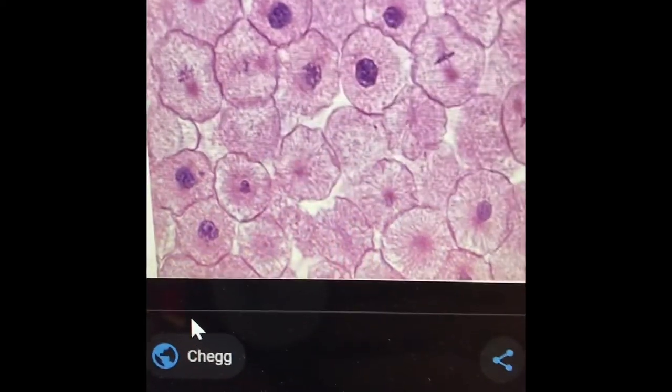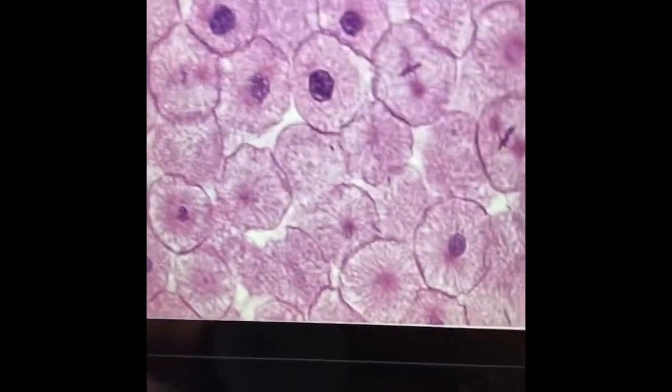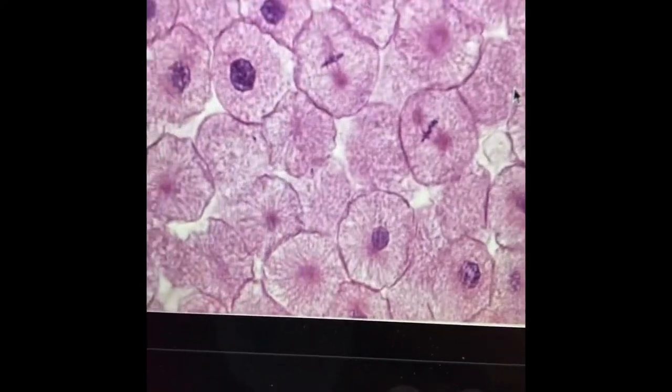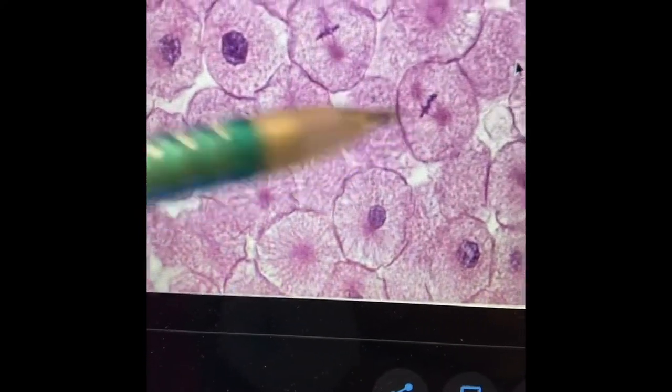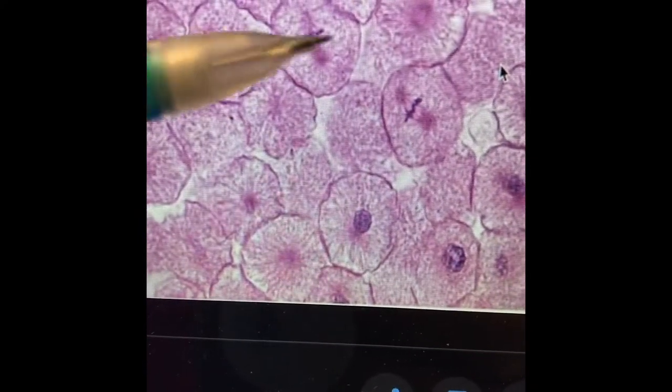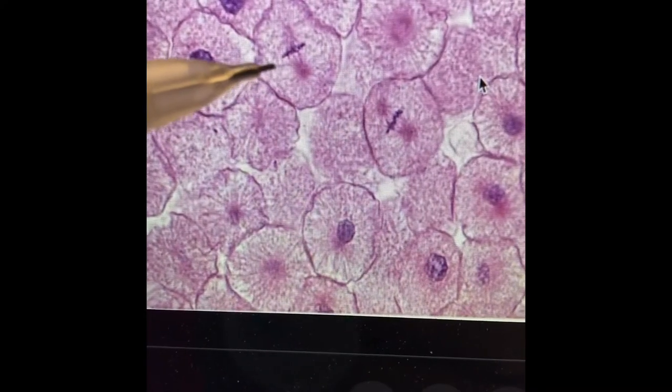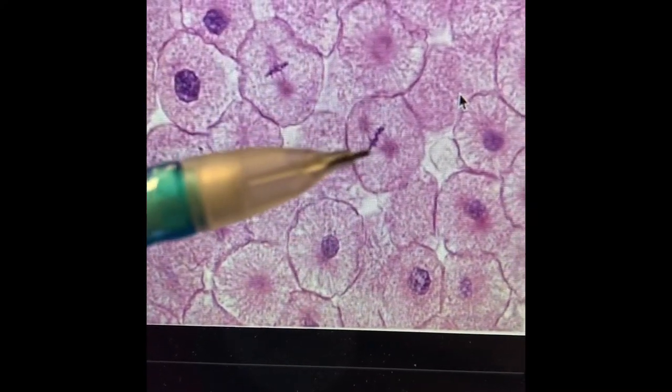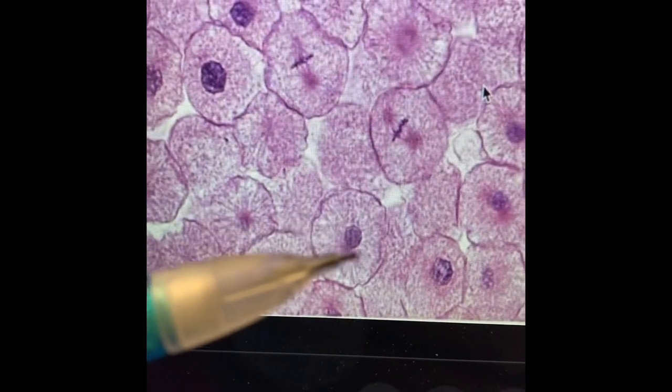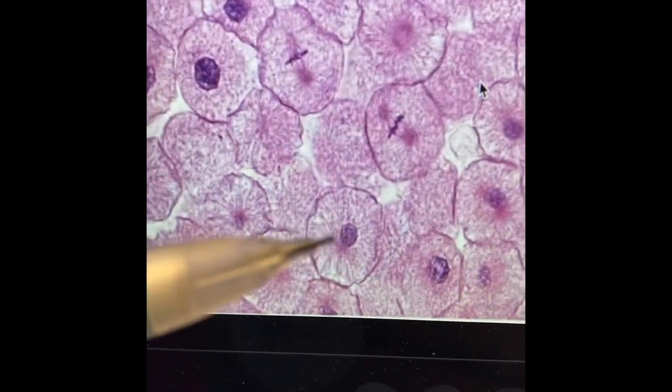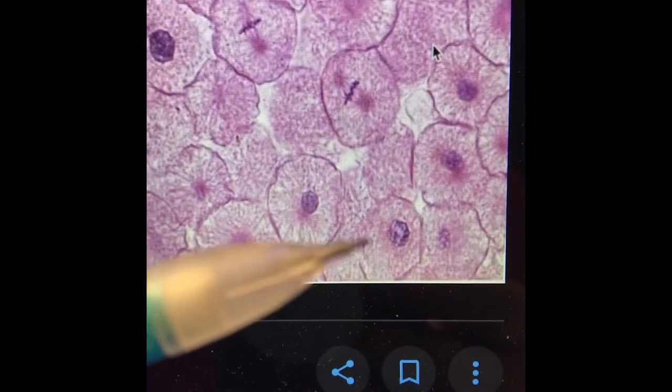Okay, so here's another view. I'm actually using the computer for this one. You can use any of these to draw your phases. But I just would like to point out because you guys weren't here to hear me do this in class. But do you see this cell right there in this one? Both of those are in metaphase. But look at the different shape of the cell. Because one may be further along meta and almost to anaphase. Like those are two classic really good metaphase pictures. Okay, look at this one right here. Do you see how the nuclear envelope, what I'm pointing to with my pencil, is fully intact, right? That is an excellent example of interphase.